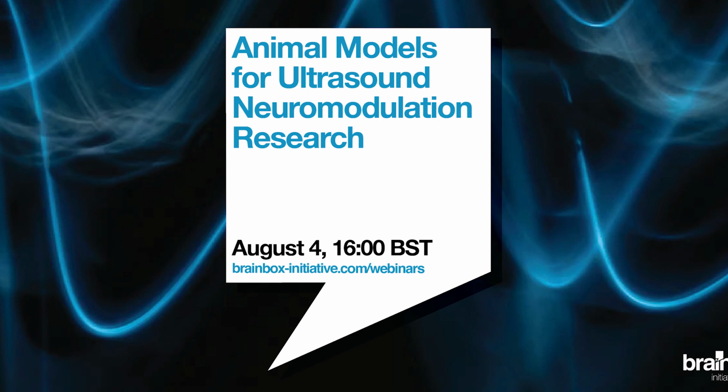So he just asked quickly, have you used fiber photometry to monitor ultrasound effects? Yes, I have. That's one of the main approaches I'm taking. It works awesome. I know there's a bunch of labs doing it. I don't know if I have too much more to say about it, unless Marco is still here. If you have specific questions, it works fantastically well. Cool, thank you. If he pops back up, I will give him a nudge.